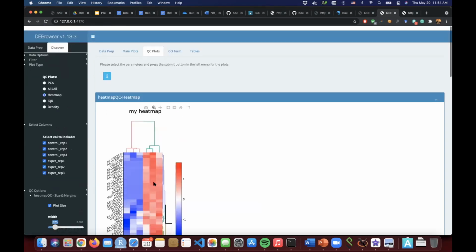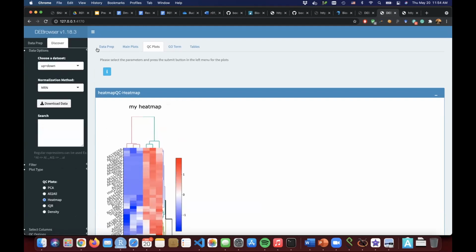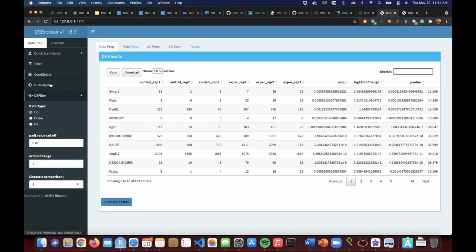Yes. Okay, so the thing is, you cannot change it inside, but what you can do, we uploaded this data, and you can actually, where is that?